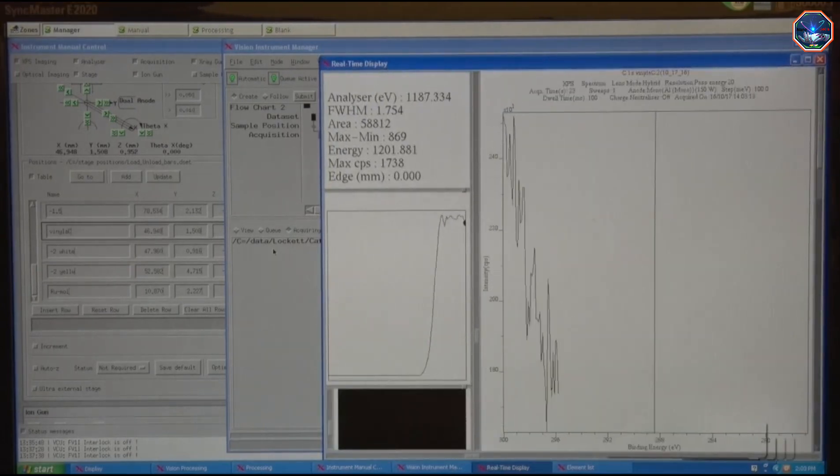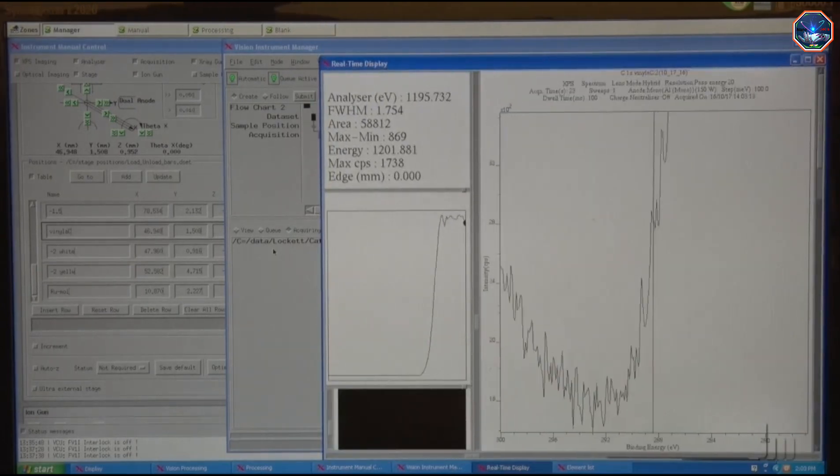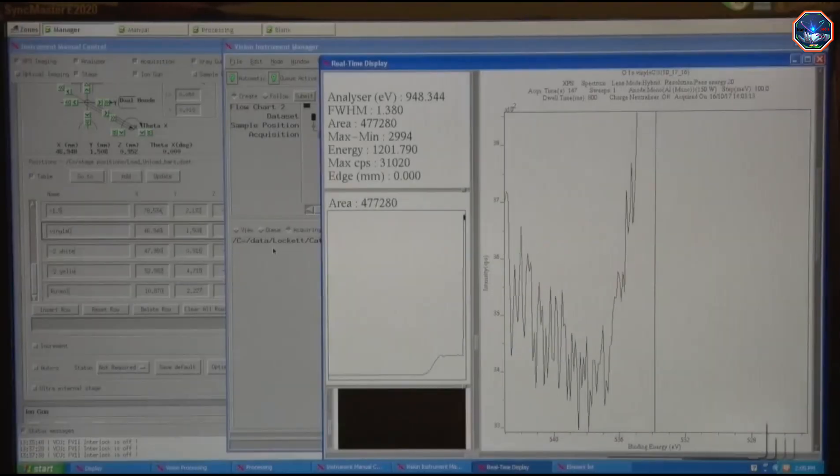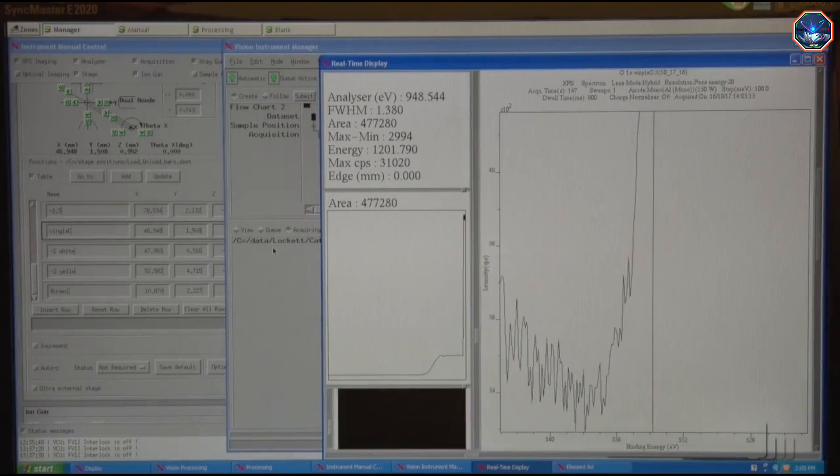The scans for carbon only take a minute or two because there is a lot of carbon present in my samples. The scans for chlorine and sulfur will take longer, about 10 minutes each, because there are fewer of these atoms on the surface.